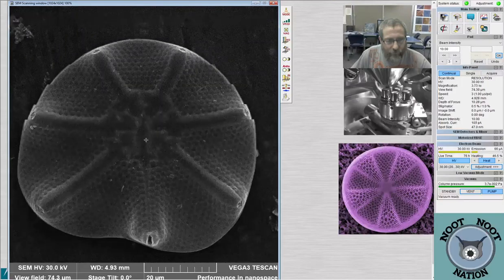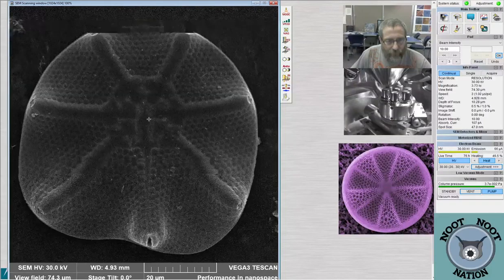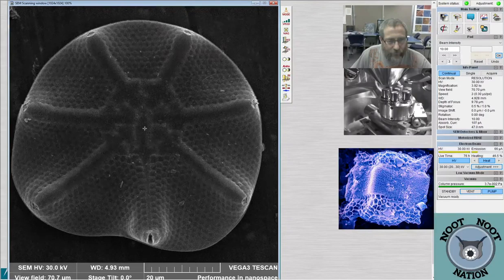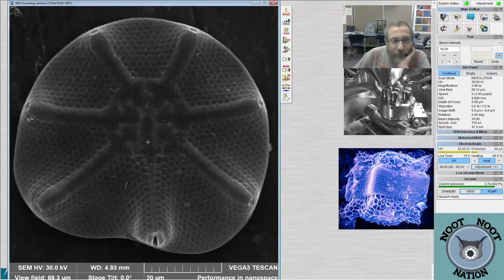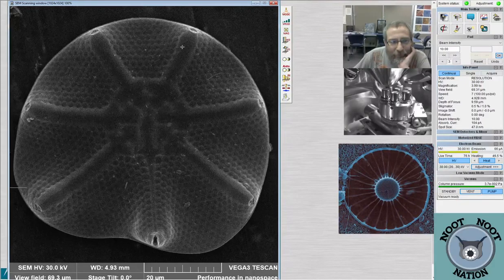So Last Miles was saying, here's a custom-made CMOS chip I worked on way, way back when an SEM output was a black and white Polaroid film. Oh, cool. That's actually the type of SEM I learned to use, the old-fashioned Polaroid-outputting scanning electron microscope. Ours was from JEOL. I don't know whether they used the chip you made.